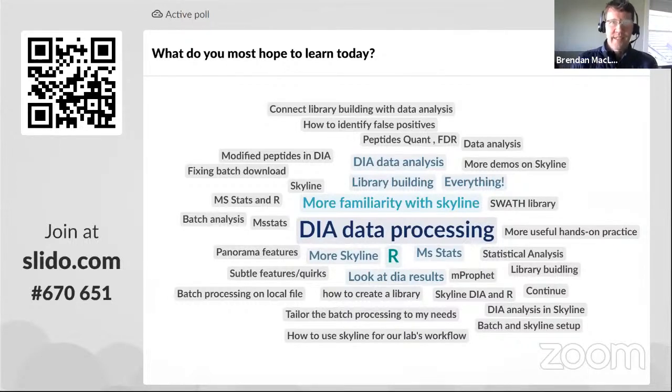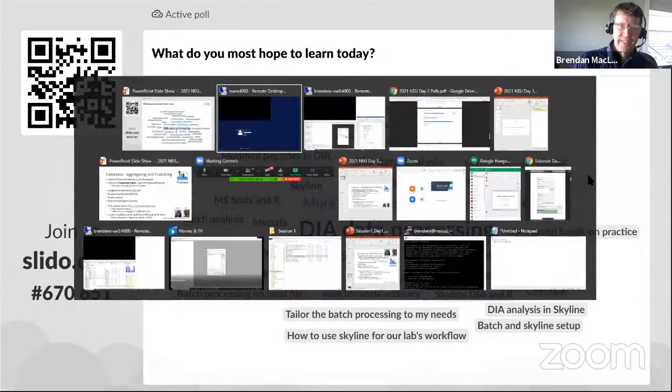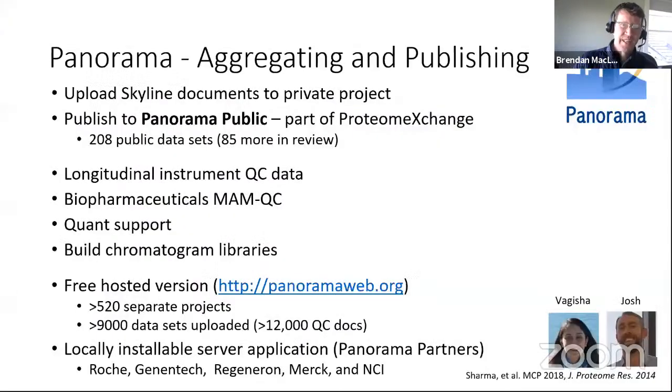All right. Well, that's good. We're gonna cut back over to the presentation slides for today to orient us on what we are going to do more hands-on. Somebody said they wanted more hands-on, and you're definitely going to get that. So moving on from Panorama, which we'll come back and look at some things on, not necessarily going through how to upload stuff ourselves.